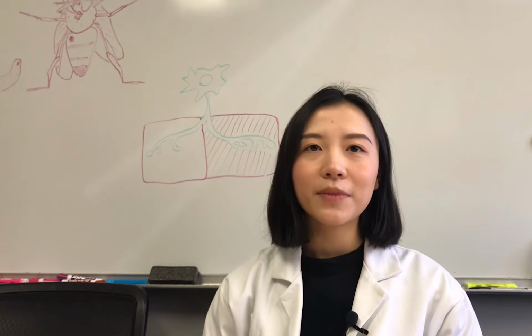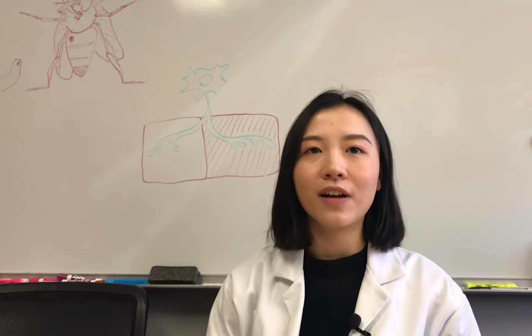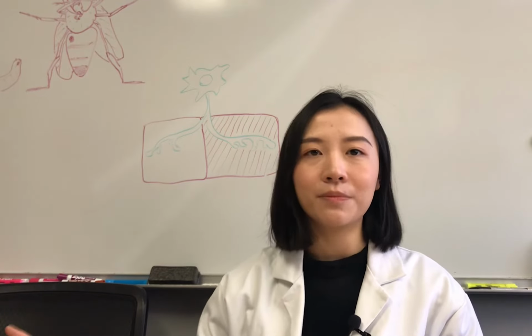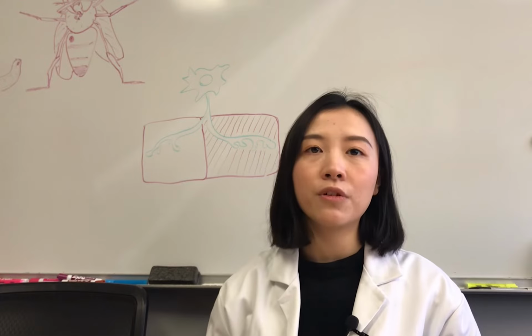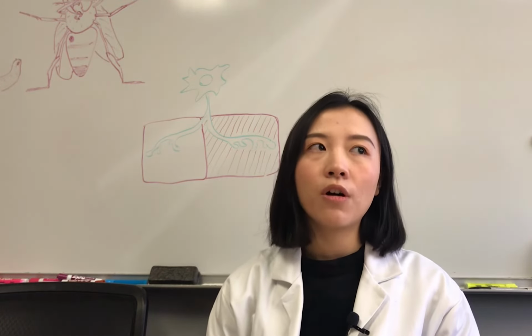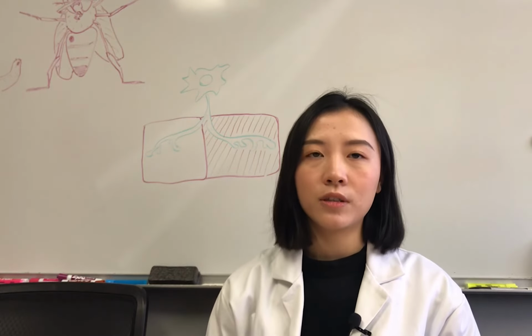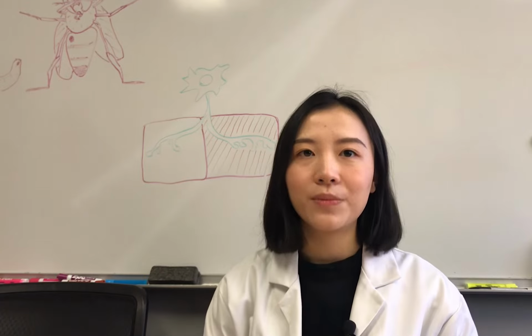I'm not the first one who started doing this in our lab. It was found out by previous lab members, and it's a great thing that we have continuously used for many years. We use the thin wall with filament for the recording, and for the stimulation, we use it without filament. Both of them come from WPI.